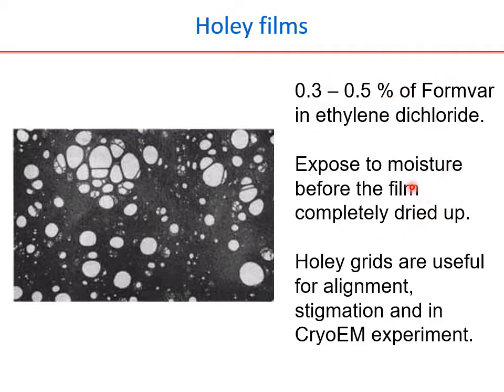So that means before the start of the experiment, you have to make everything ready. The slide should be ready. The solvent should be ready, the moisture at the optimal level should be ready, and these should be in close proximity so that the transfer of the slide from this to this is minimized.